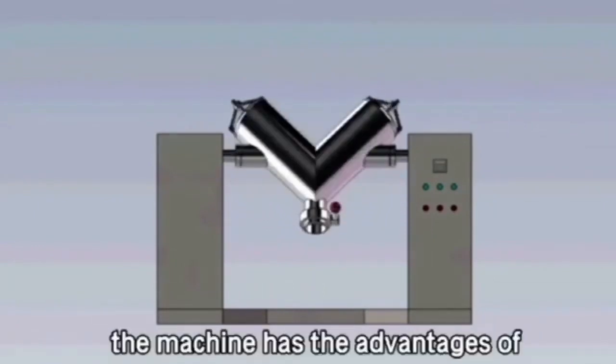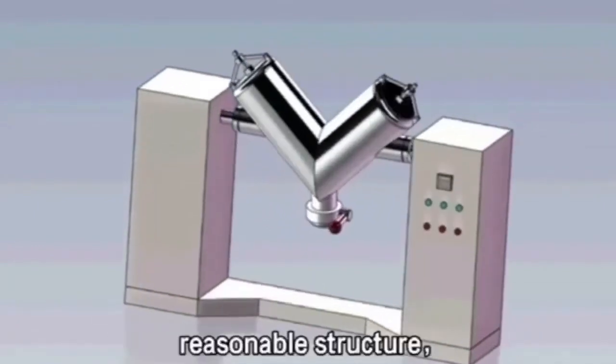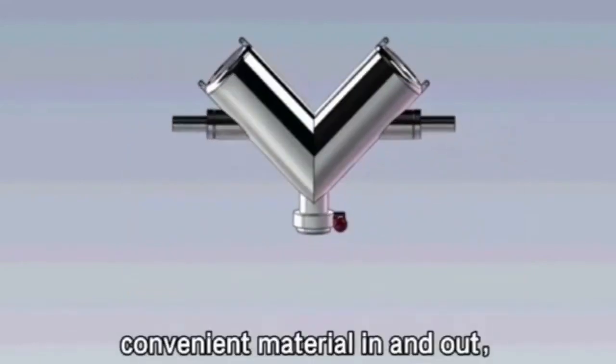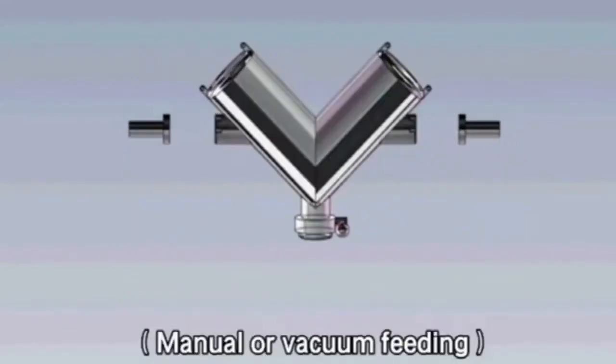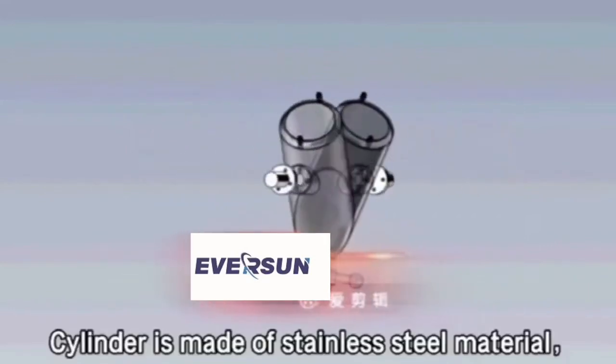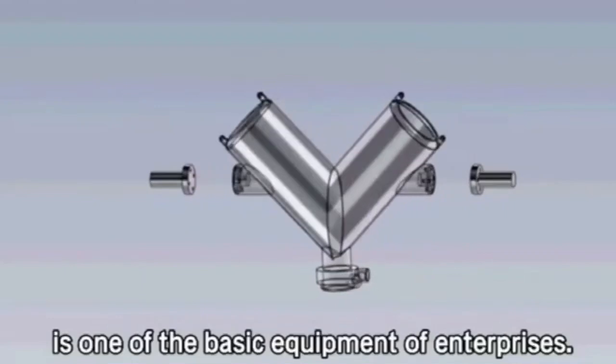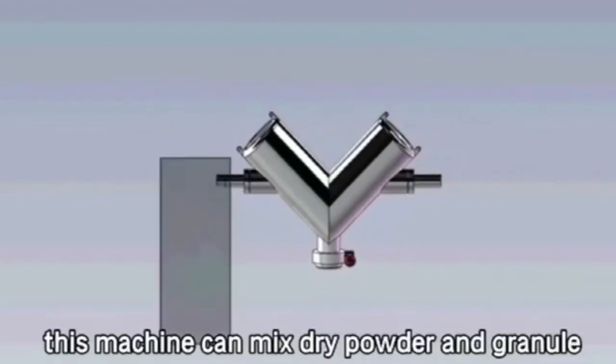The machine has the advantages of reasonable structure, simple operation, airtight operation, convenient material in and out, manual or vacuum feeding. The cylinder is made of stainless steel material, easy to clean, and is one of the basic equipment of enterprises. This machine can mix dry powder and granule.